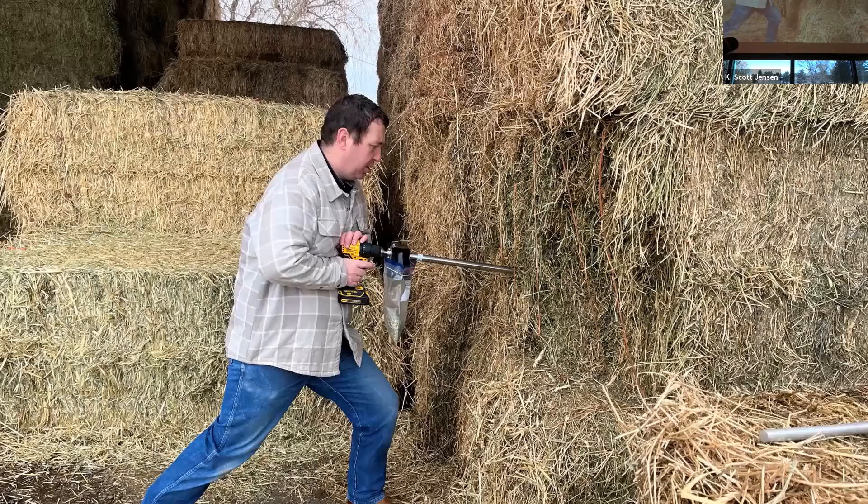Here's a photo of me getting hay samples — going right in the center of the bale. With alfalfa bales they're usually denser and a little harder to get through, requiring more effort, whereas grass bales are less dense and easier. You have to be careful with grass bales — if you don't have an extremely sharp cutter head, the leaves and material will bind on your cutter and actually cover the cutting edge.